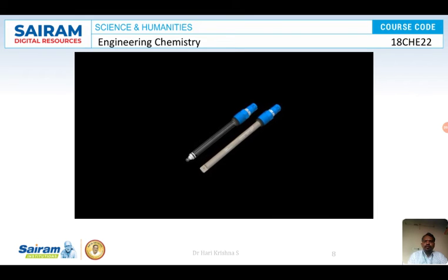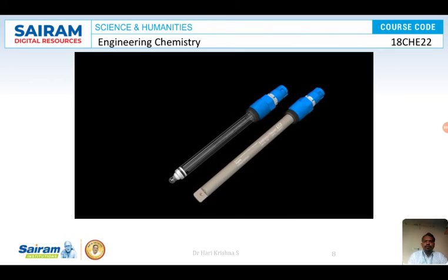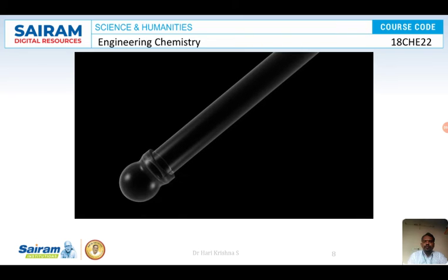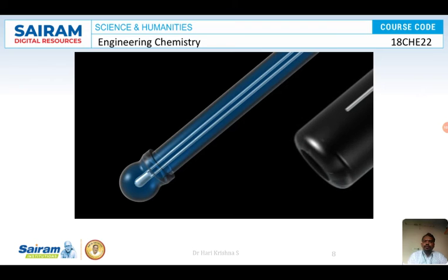Potentiometric pH measurement is the measurement of a potential difference using so-called glass electrodes or non-glass electrodes. In the case of glass electrodes, the pH-sensitive element is a glass bulb that is fused to the end of a glass tube. The electrode is filled with a neutral potassium chloride solution buffered at pH 7, and contains a silver-silver chloride wire that forms the electrical internal connection.